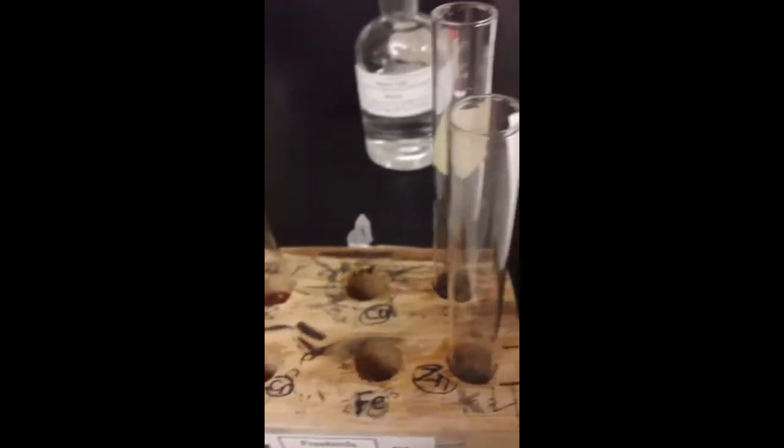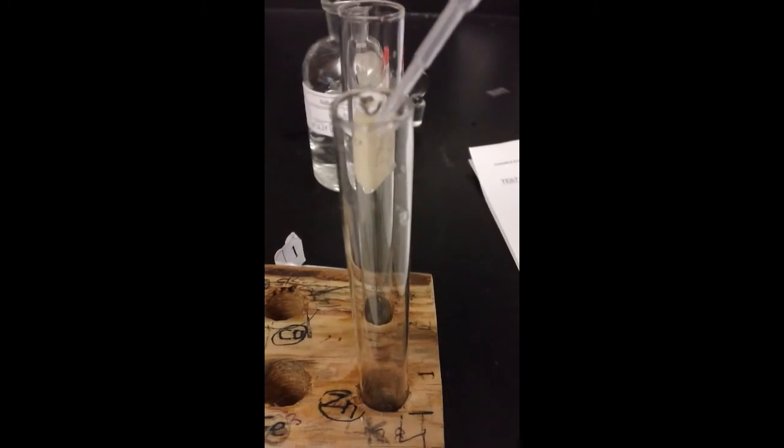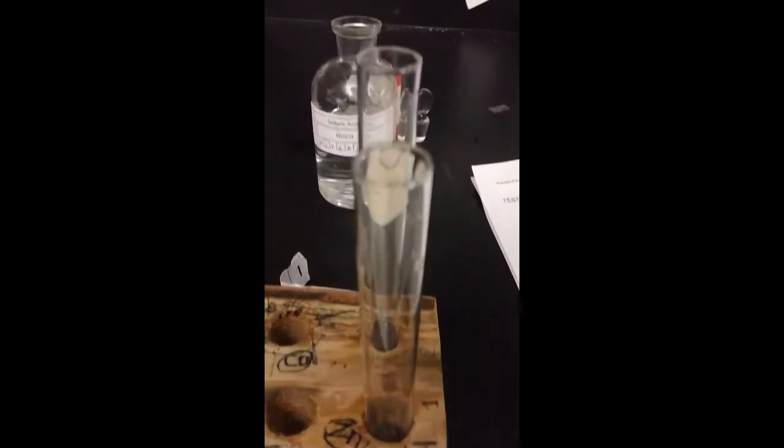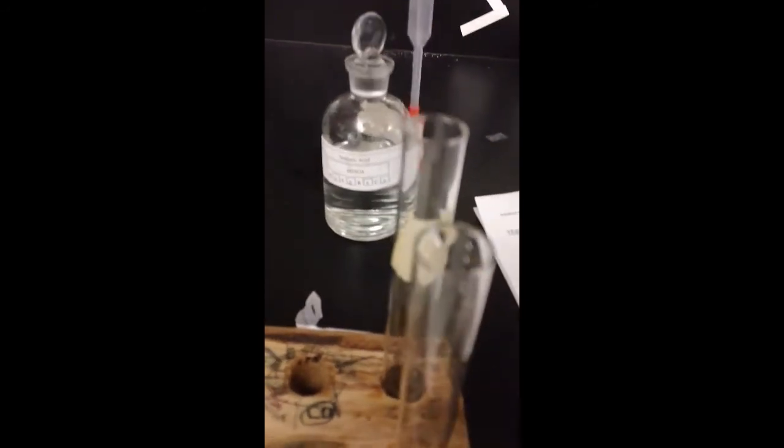So we're going to bring this over to our H2SO4. I'm going to take my directions with me. So double check the bottle, H2SO4 against H2SO4. Okay, so now what I need to do is add 8 drops. Okay, add 8 drops. Okay, so notice what I've got now.